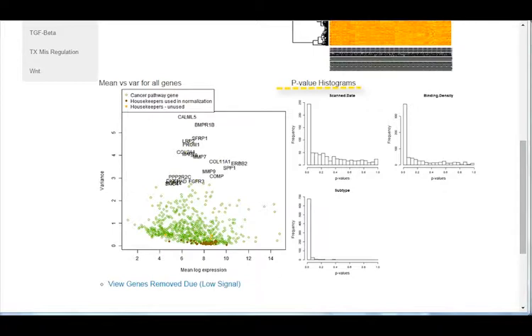In some cases, a covariate with no effect will be correlated with a covariate with a powerful effect, producing a left-weighted histogram. This phenomenon is likely the case with scan date, whose association with so many genes is most likely a result of its separate association with the covariate subtype and not a real effect present in the data. The histogram for binding density is more likely a real effect.